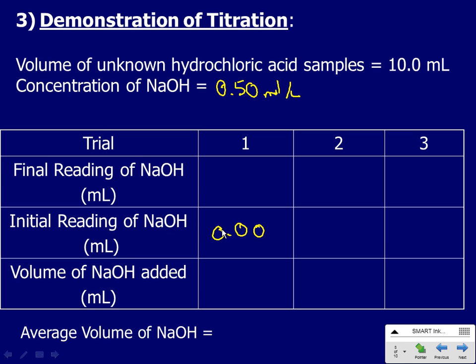That's no good. I've gone too far. That's too dark. A good titration should be just a hint of that pink. Just a hint. Because we don't want to be in that 11 spot. We want to be right at that 7. And it just starts to turn pink a little bit at the 7. No good. Failure. So I have a number there, but it's useless. So let me tell you what the current number is.